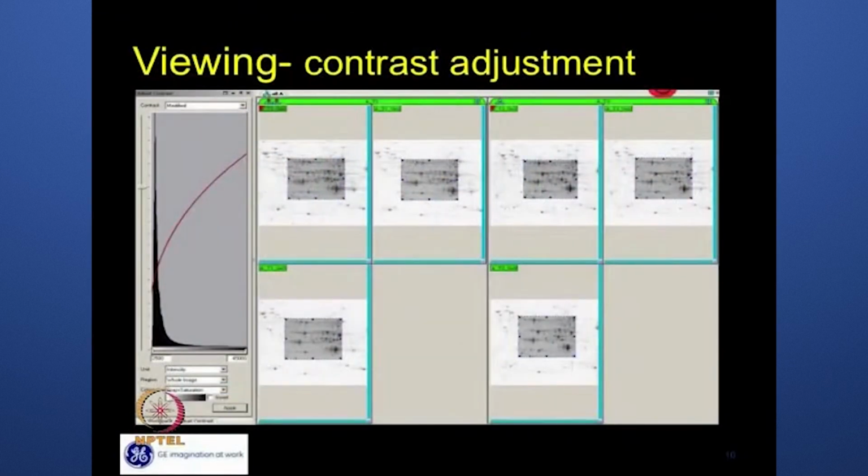How to adjust the contrast in our workflow? You can see there is an option from View to change the complete contrast and brightness, whatever you want. In that case, you can select any one of the boxes from the select tool. After selecting that particular box tool, you can change whatever you want from the x-axis, and from the y-axis you can see the contrast as well as brightness. You can see the real changes in this particular block.